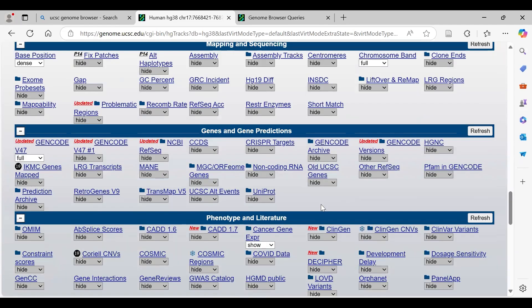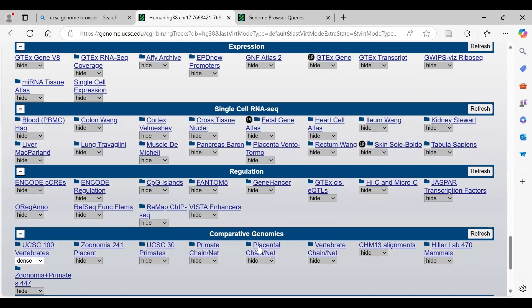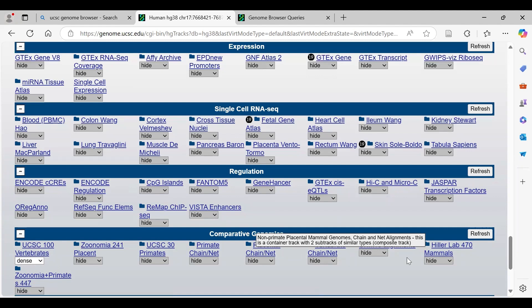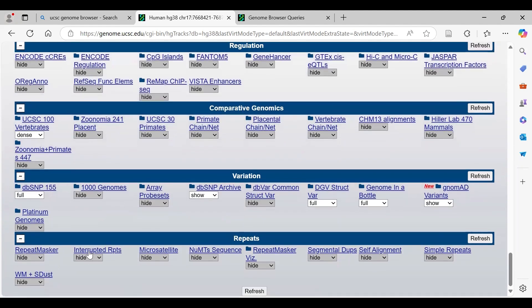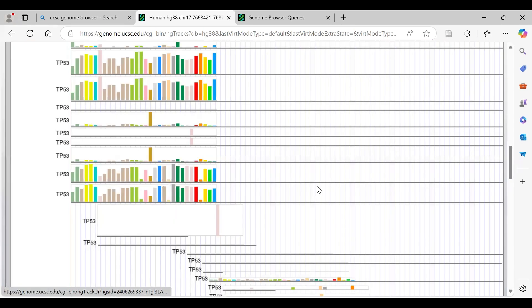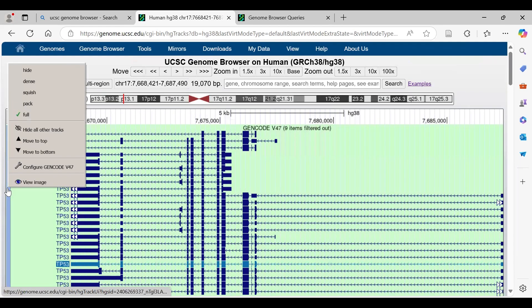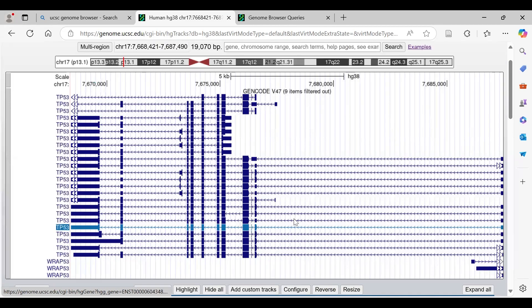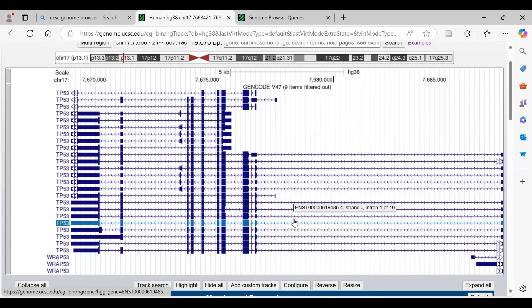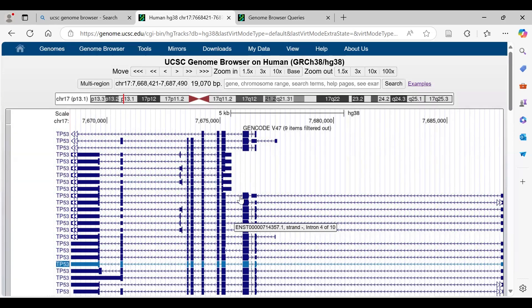Transcript expression level information is also available here. For comparative genomics, if you want to compare the sequence of this gene across different organisms, you can select it and set to full and it will appear above. For repeats, you can show repeat maskers, microsatellites, and similar features. If you want to hide all tracks, you can hide all other tracks and then manually re-select what to add to the screen.